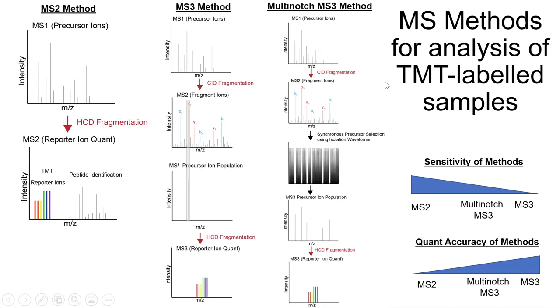And so this means that it's got to be done really quickly. And so this is one of the areas of development in the software for the mass spectrometers, within the instruments, is to try to keep improving this. And we actually, in the proteomics core, just got a new instrument that's supposed to have some new functionalities in this to try to improve that prediction. And so that is a really important thing, because in the meantime, it's basically making educated guesses in different ways, but it is usually intensity based, like what Caitlin had said.